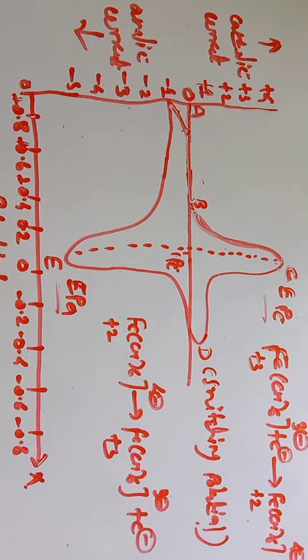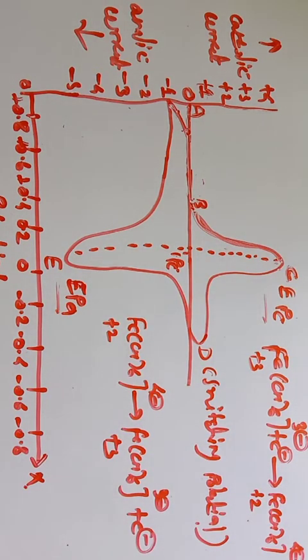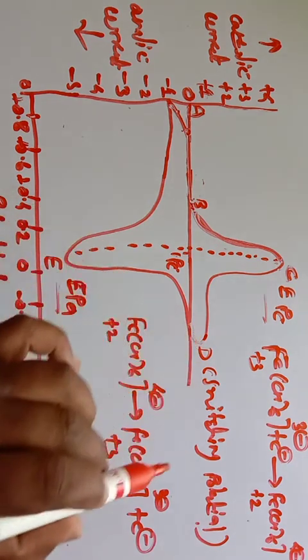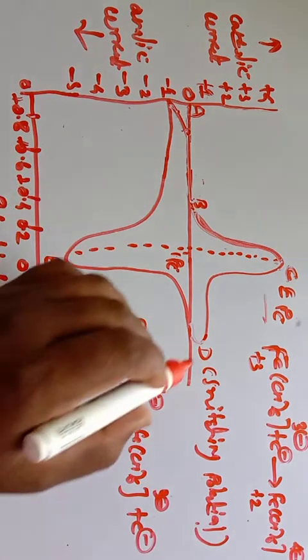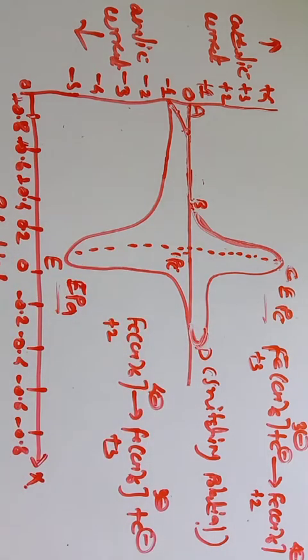The potential is switched and the scan direction is switched, and the current, however, remains cathodic, even though the scan is towards more positive potential. That is, when we reach this switching potential and switch, the current is still slightly cathodic, because we do not get the anodic current directly. We switch the potential, but the current we get is cathodic.